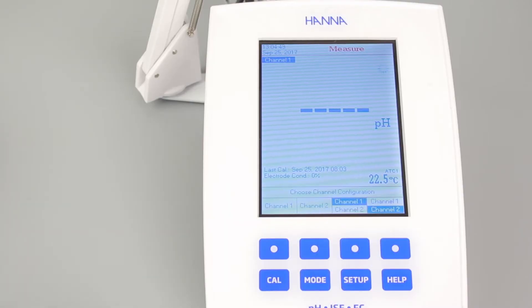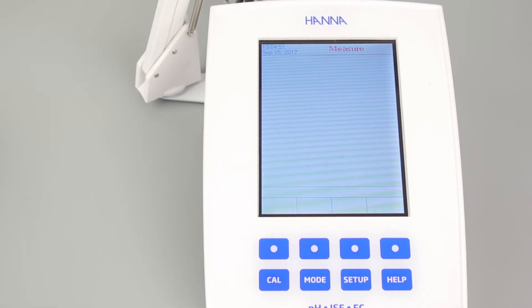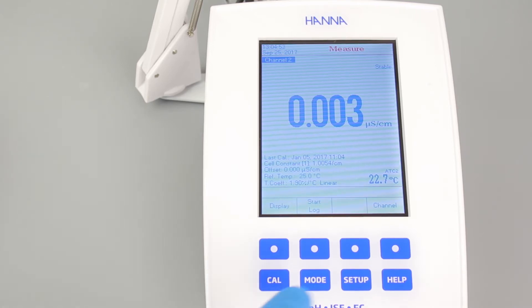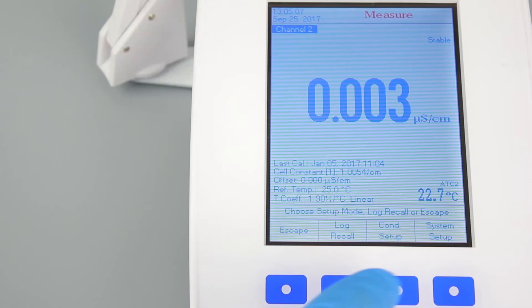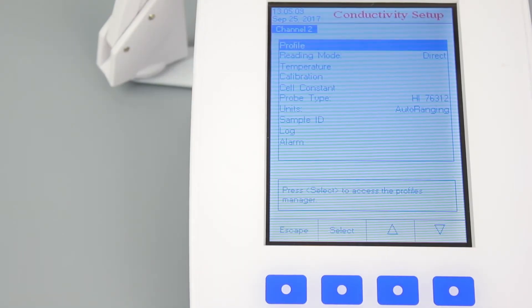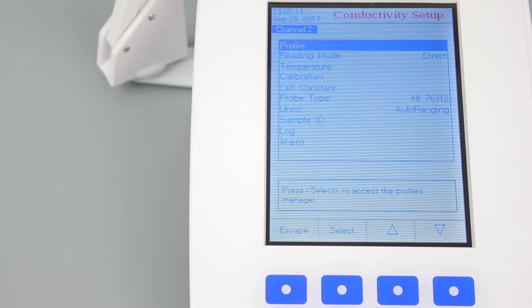You can also view the conductivity setup by selecting the appropriate channel and going into the setup. You will find everything you need to customize your measurements here. With all the options to choose from, I really recommend going through each setting to determine what will be best for you. Once complete, you are ready to begin calibrating your meter.